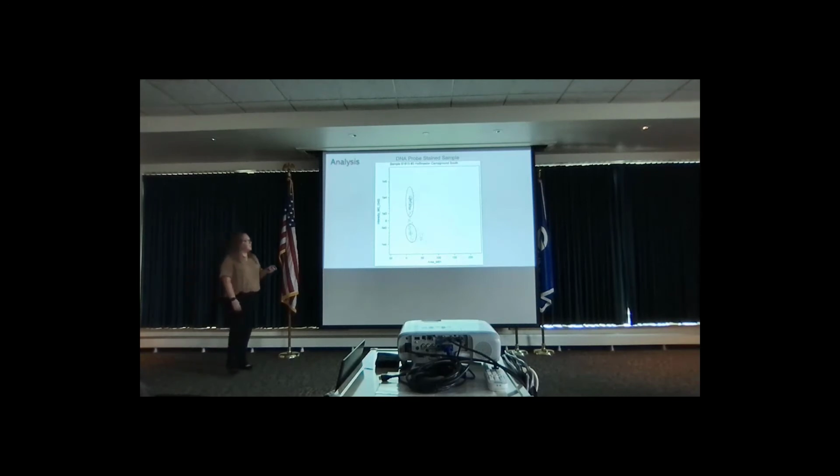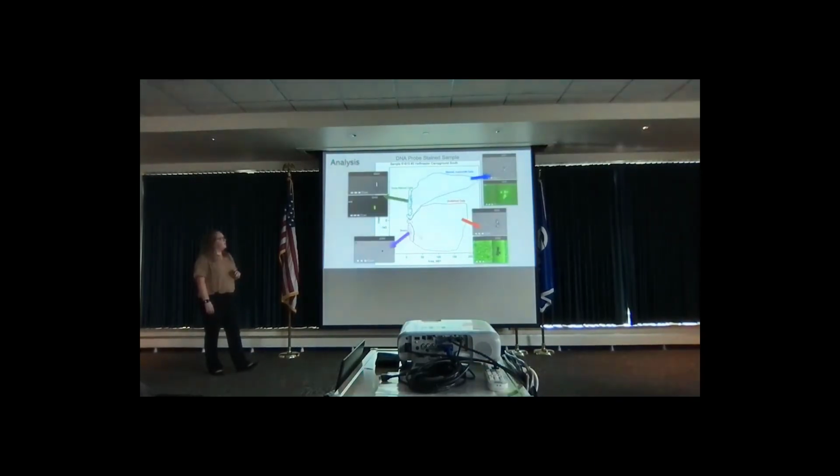So this one had some clumping of cells too, in different areas, higher and lower in the graph. And when I looked at it further, I noticed that the top one was actually the probe cells and the bottom was the beads. And then if you look at this big region right here that I called inaccurate cells, this is what they looked like. We don't know exactly why they did that, but we think that it may have been centrifuging and it just created a big cluster of stained cells. And I put them as inaccurate because I wouldn't count them in the final count, because they're a little big.